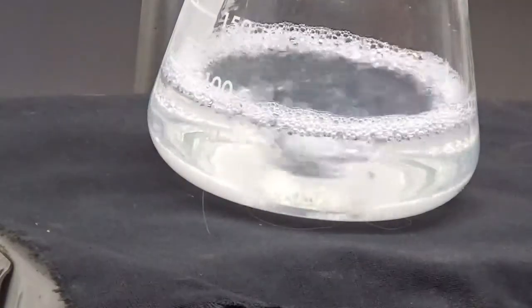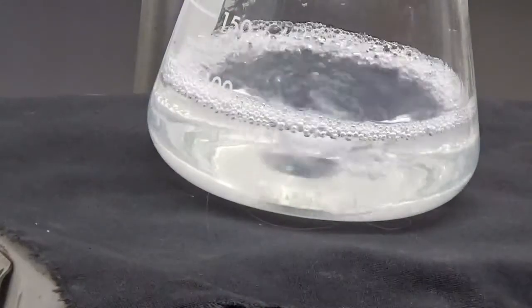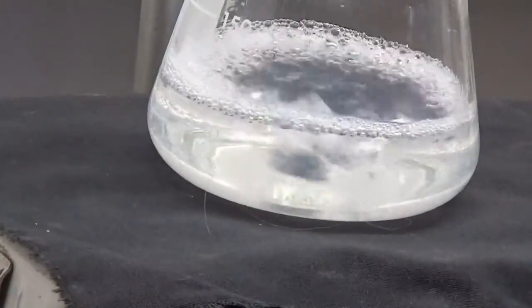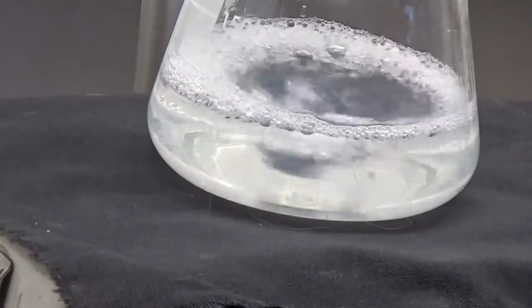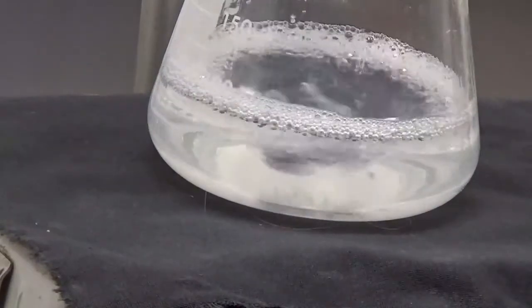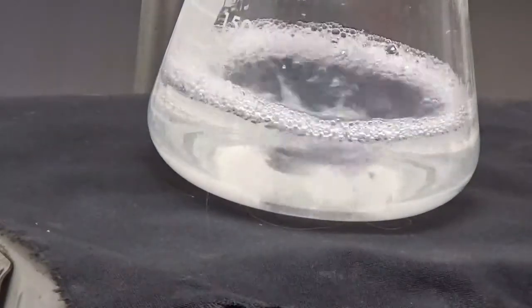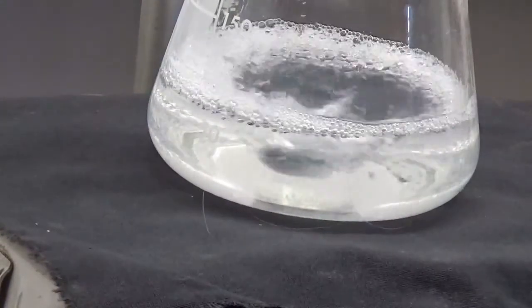There's one more drop. I'm going to call that it. That's the turbid point for this one. I don't know, maybe one more drop. Of course, I added 6 drops, but them's the breaks.